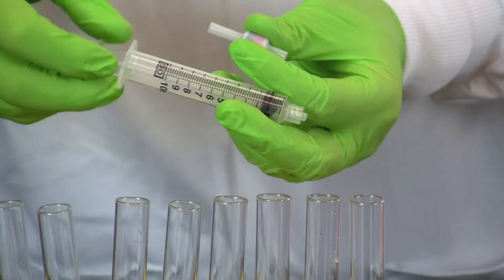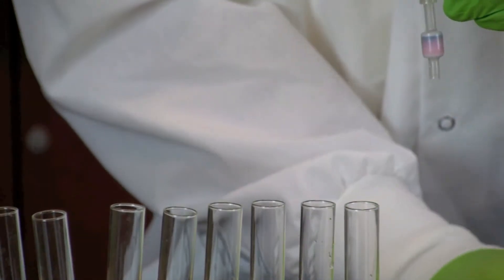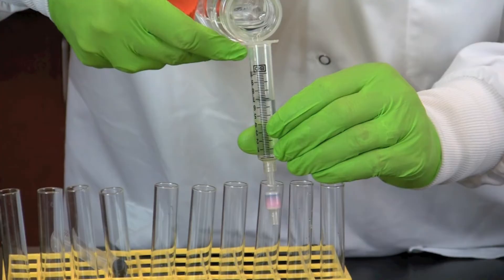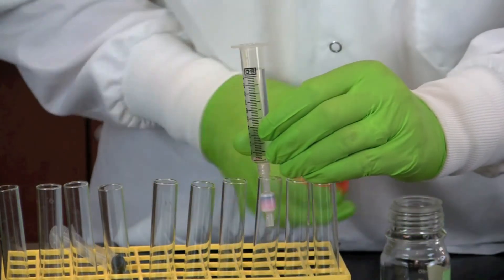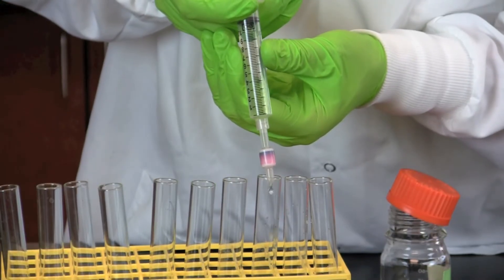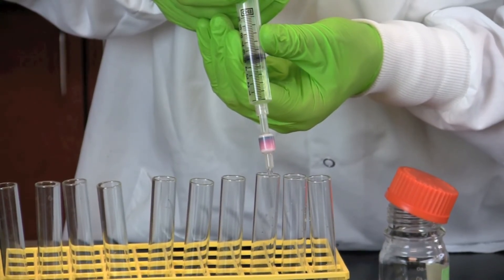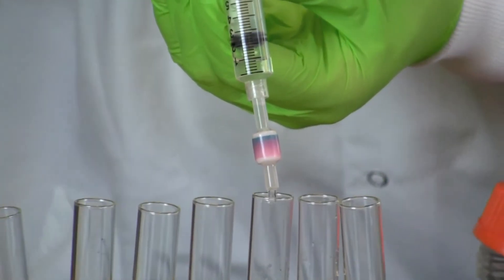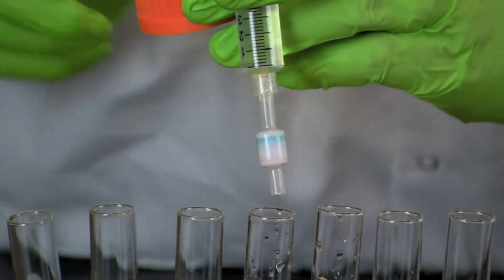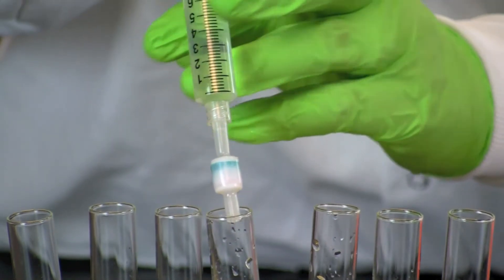Once the flow through is clear, remove the cartridge, pull out the plunger, and then reattach the cartridge to the syringe. You will now add 10 ml of 25% 2-propanol. Replace the plunger and push the alcohol through the column. Collect the flow through in the next empty test tube. Once all of the pigment has come off the column, push a final 10 ml of 25% 2-propanol through the cartridge and collect the flow through in a final test tube.